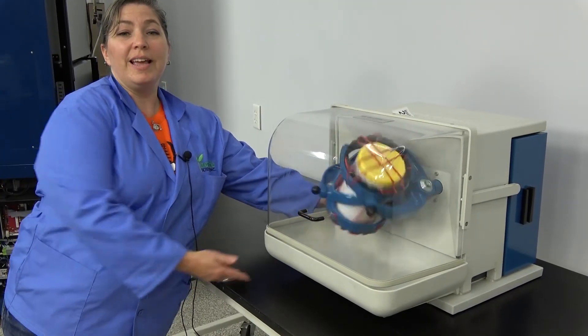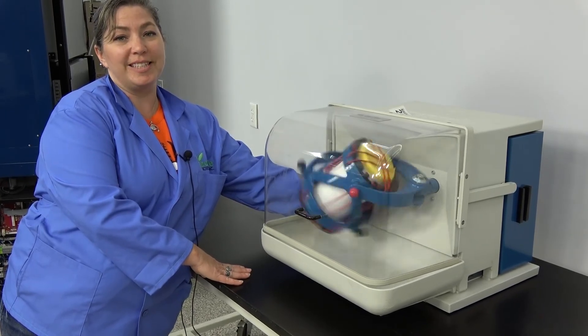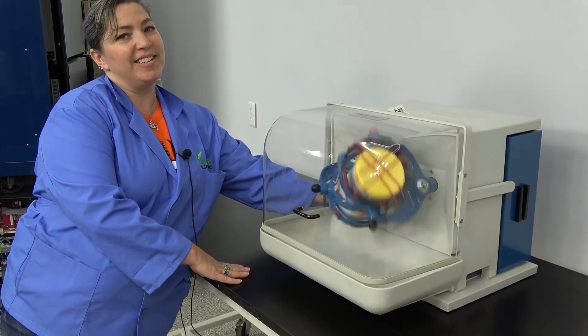This unit is available in our Cartersville, Ohio facility and is backed by our 90-day warranty.